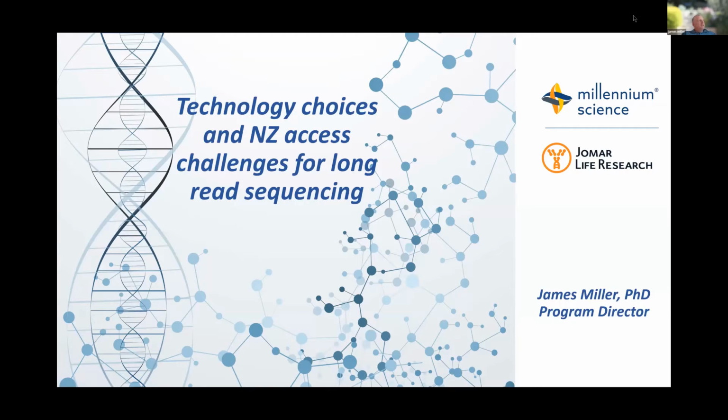What I'm going to do is lead on from Paul, dig in a little bit more about HiFi and talk about technology choices and access challenges in New Zealand for long read sequencing, in particular PacBio sequencing. I noticed a few people in the poll mentioned that they were planning to do some type of project using some other technology other than HiFi.